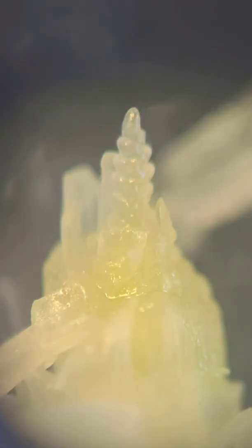And here is our first example. And can I just say I was quite pleased with how some of these pictures turned out. Taking a picture through a microscope lens with your phone camera is not the easiest thing in the world. But yeah, here is the first meristem. It's pretty undeveloped still, probably call it a 2. Here's the second one, also about the same stage. You see little nodes forming, but they're not defined, so probably also 2. And then this last one here is still vegetative stage.